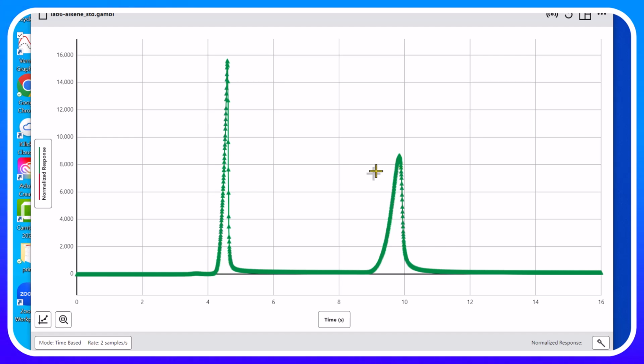So the idea is that you want to, let's say, first of all, find the time. And so you're going to click near where you think the peak is. And I notice, okay, the time here is about 3.6 seconds listed here. Note that that should be 3.6 minutes. That's what you would record. And then I can guesstimate, well, the next one is here around 4.6 seconds. So it should be 4.6 minutes.